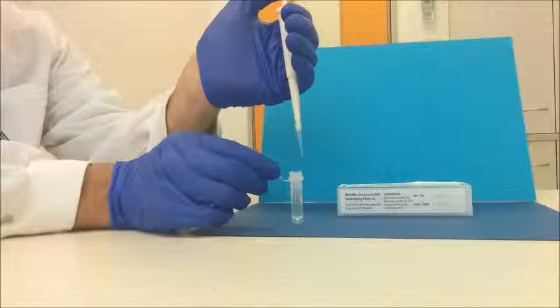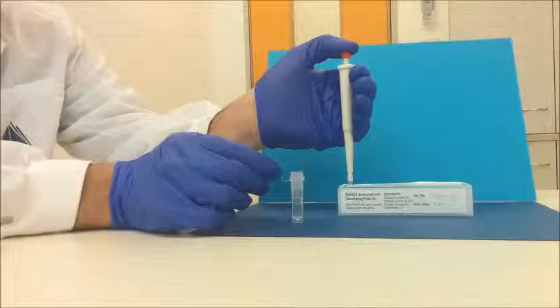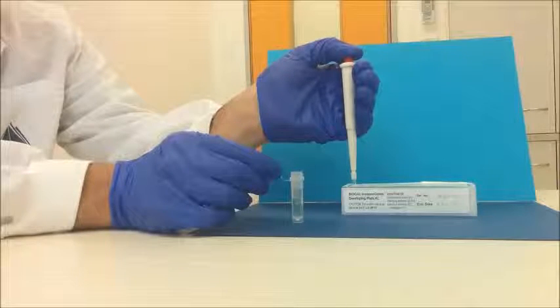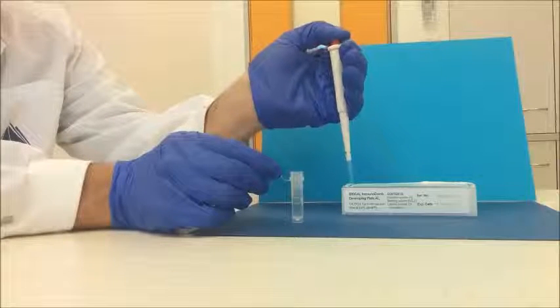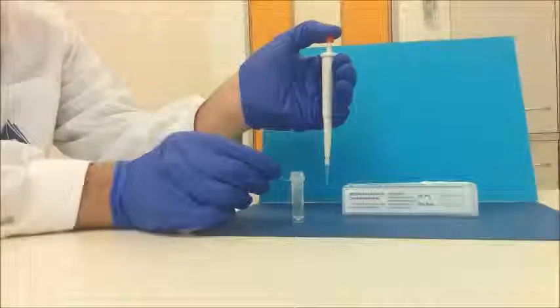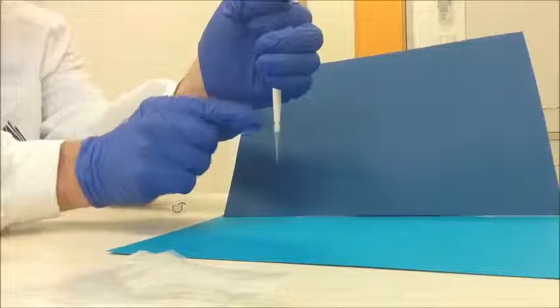Dispense the liquid into the receiving vessel by gently pressing the operating button to the first stop. Then press the operation button to the second stop — this will empty the tip completely. Remove the pipette from the vessel by sliding it up the wall of the vessel, then release the operation button to the ready position. Remove the tip once it has finished being used and dispose of it correctly.